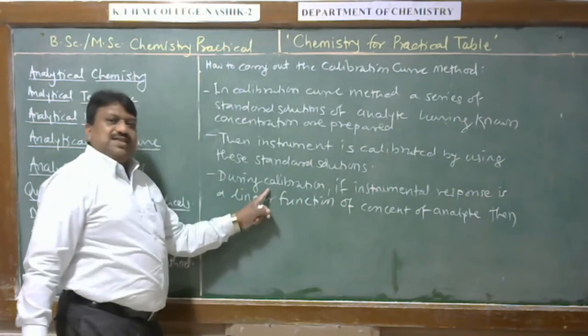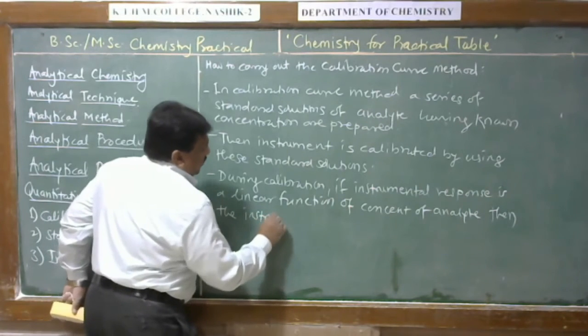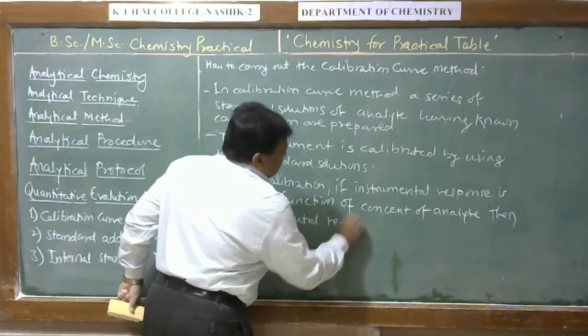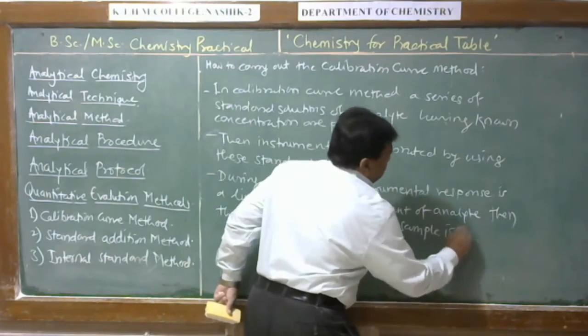And if we observe this during the calibration, then the instrumental reading for sample is recorded.